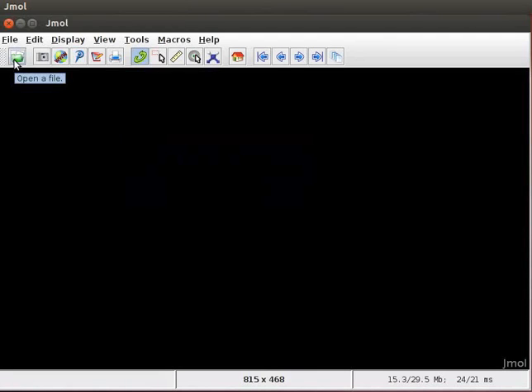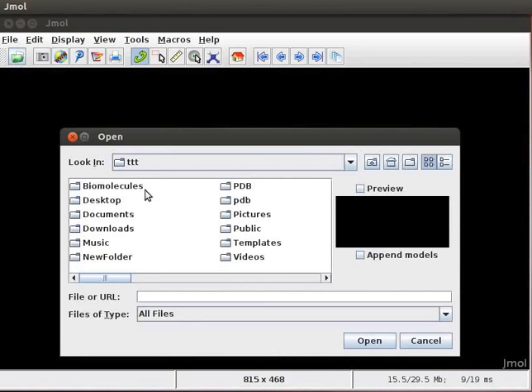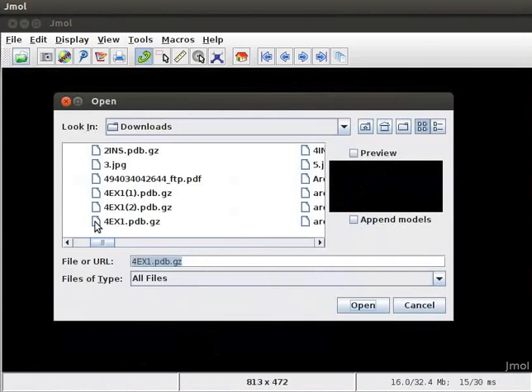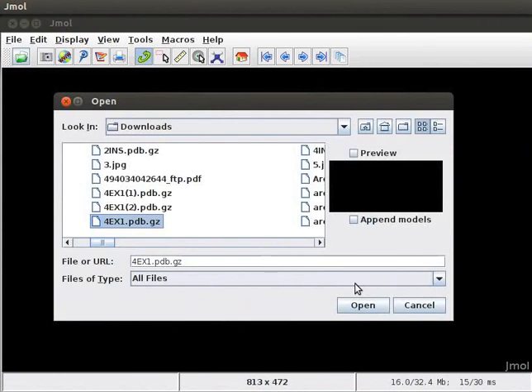If you are not connected to internet, then click on Open a file icon on the toolbar. A dialog box opens on the panel. Navigate to the location of 4EX1.pdb.gz file that is to Downloads folder. Select Downloads folder and click on Open button. Select 4EX1.pdb.gz file and click on Open button.